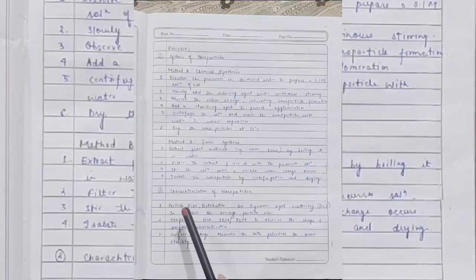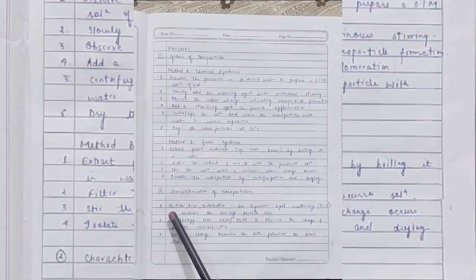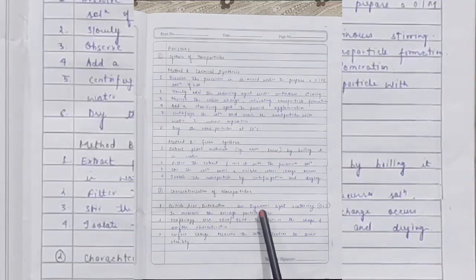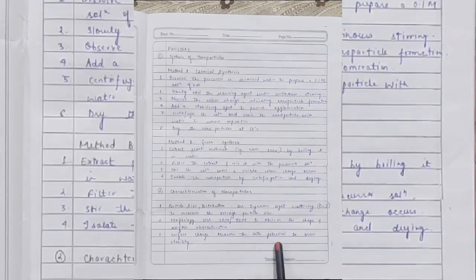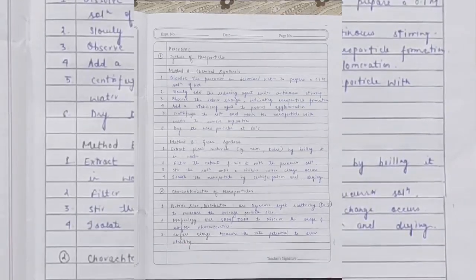So, next we will be discussing the characterization of nanoparticles. Number one will be particle size and distribution. So, use dynamic light scattering, DLS, to measure the average particle size. And for the morphology, use SEM or TEM to observe the shape and surface characteristics. Next, for the surface charge, we can measure it with the zeta potential to check stability.